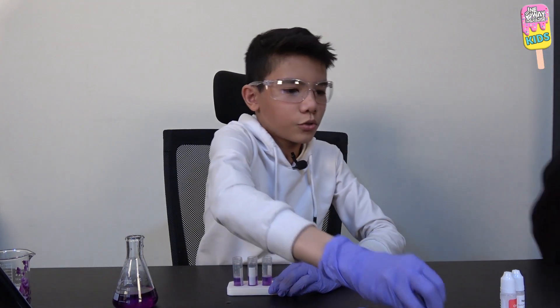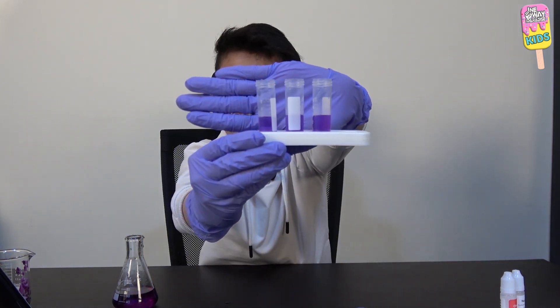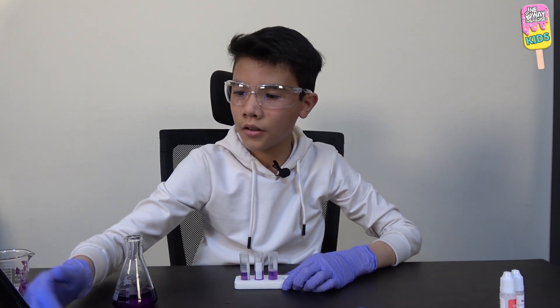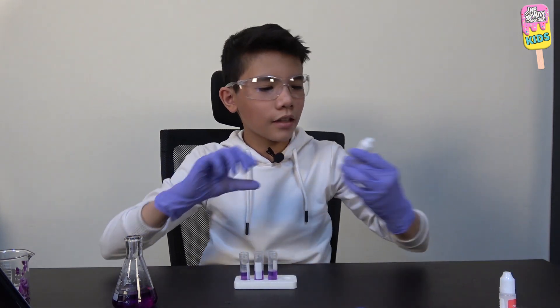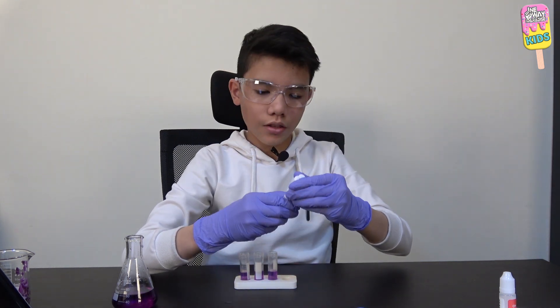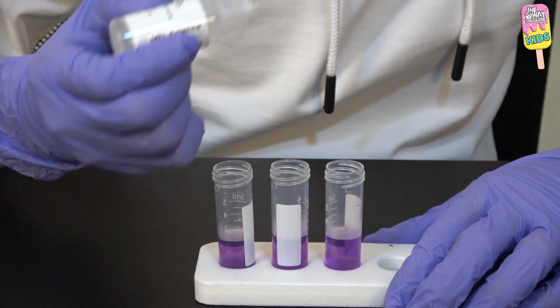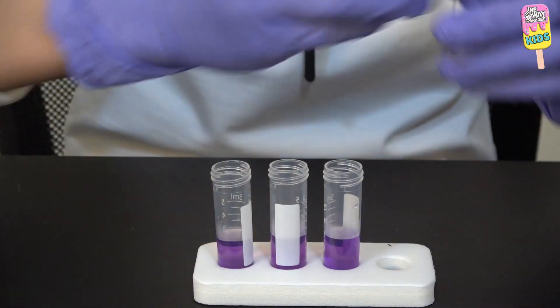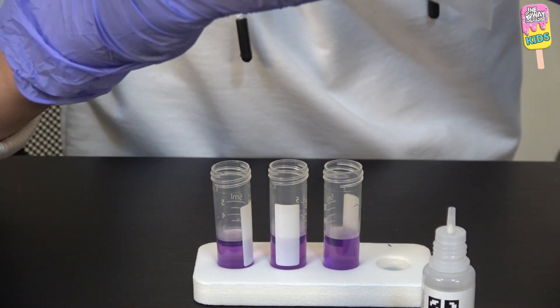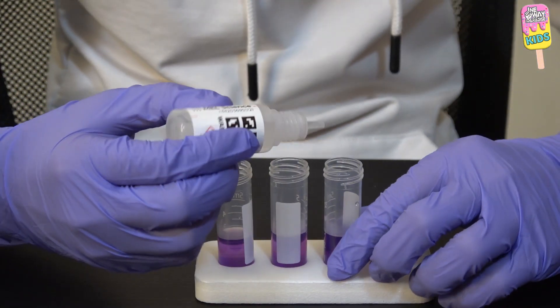I just filled three of the test tubes or vials with three milliliters of our cabbage water. Now I'm going to add in some of our solutions. I'll first start with the sodium carbonate. I have to remove the stopper first, and then add five drops of sodium carbonate into our cabbage water. Bismillah.